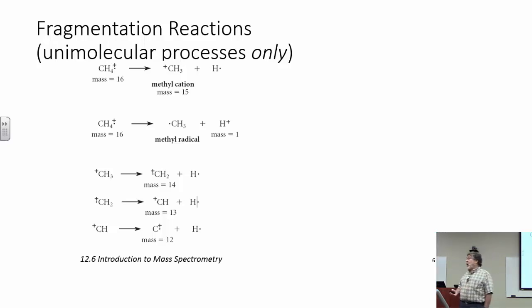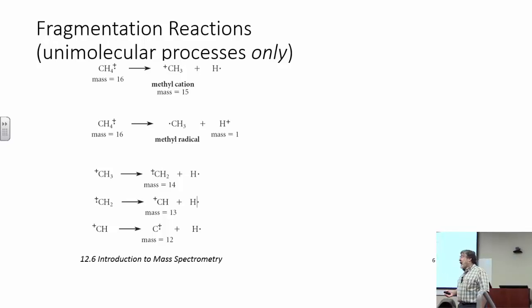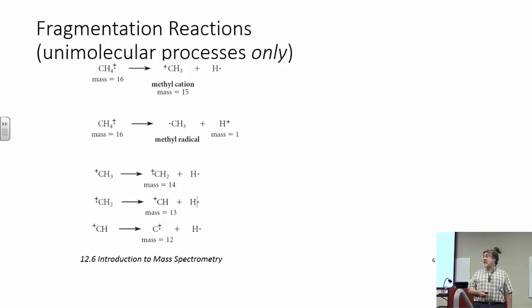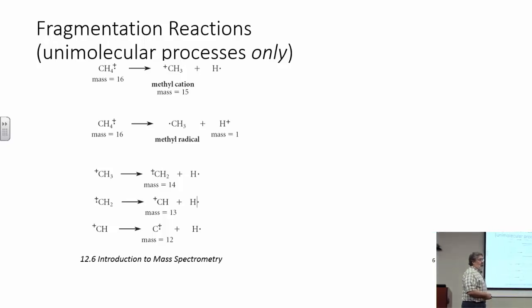And as with IR, when you're looking at a real mass spec, you cannot try to find meaning to every single peak that's present. You find meaning to the couple of peaks that are important in the context of a particular question. Okay? And I hope you realize that's the message throughout this spectroscopy chapter, actually chapters, because the next one's NMR. NMR is the one that you can be most thorough with. You can find meaning to just about everything. All right.